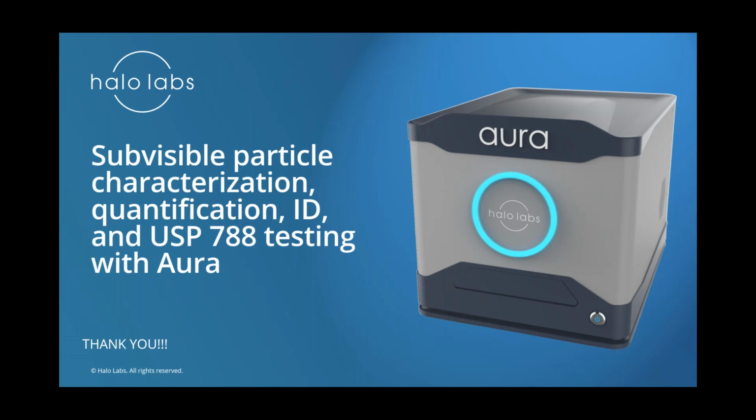Percent variability. Do we have an expected percent variability that we would expect from a typical sample? It's a good question. It's highly sample dependent, but for example, bead standards we measure within a 10% threshold. For thermally generated aggregates, typically the CVs are below 10%, with sufficient particle population, say above 20,000 per mL.